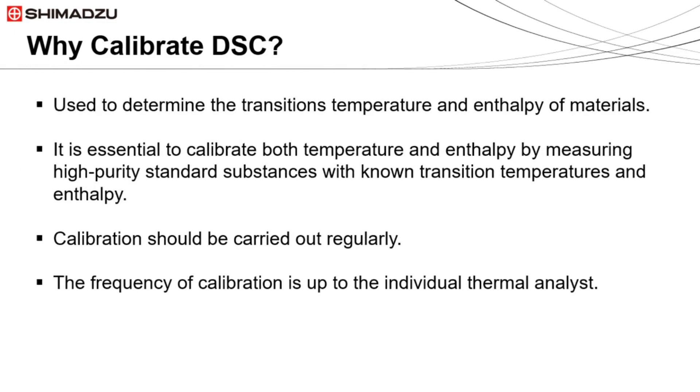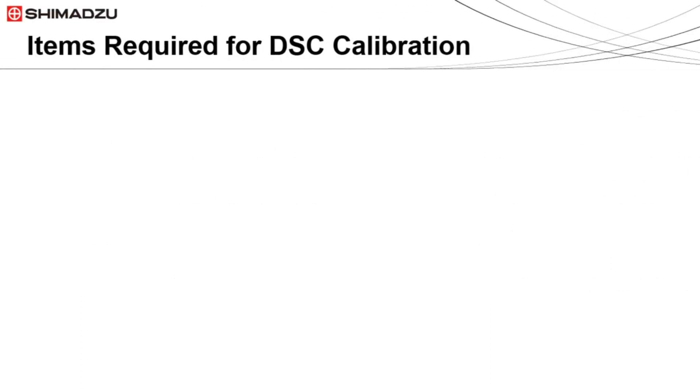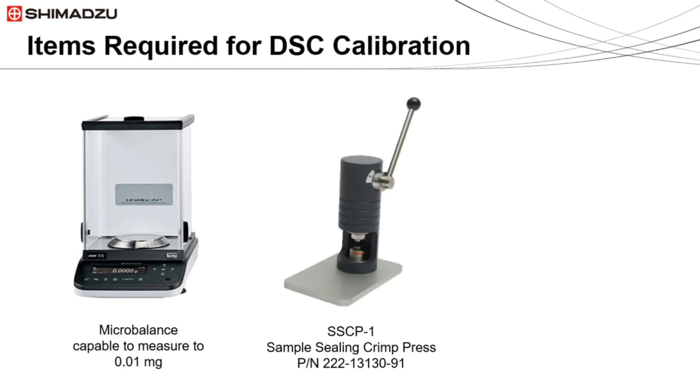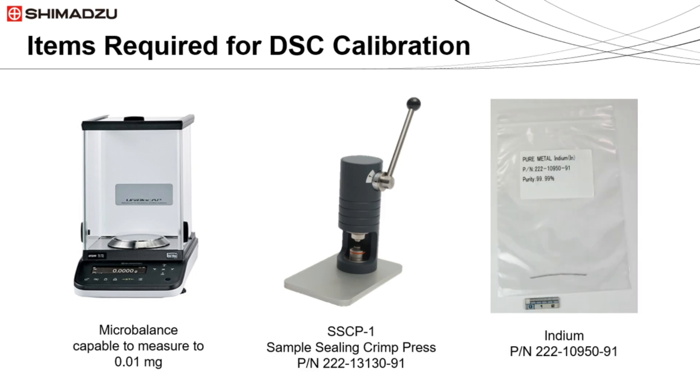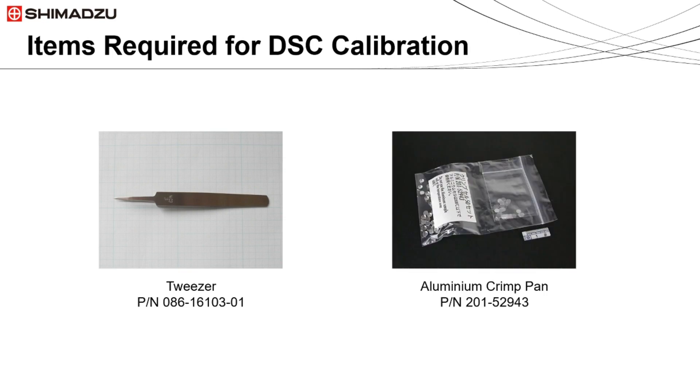The frequency of calibration depends on how often the instrument is used and what samples are analyzed. Here are the items required to calibrate the DSC-60 Plus: a microbalance capable of measuring to 0.01 milligram, the SSCP-1 sample sealing crimp press, indium, tweezers, and aluminum pans.